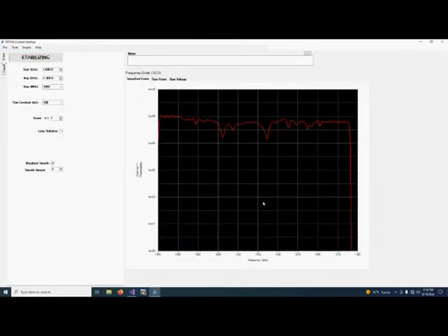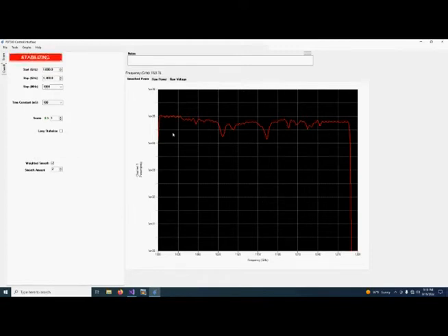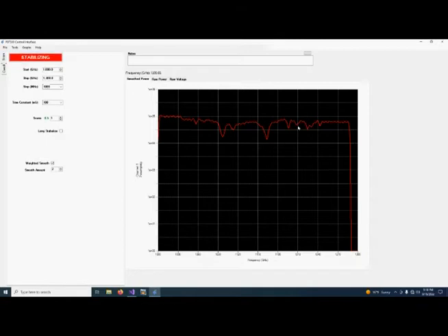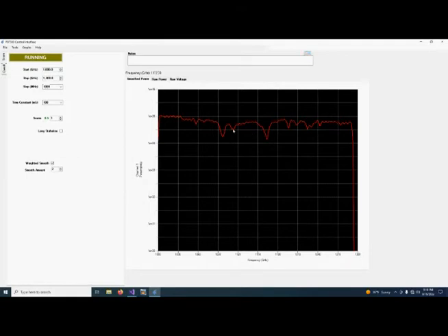And as you take more and more data so that these systems can do averaging where they scan up in frequency and then back down, the noise on the signal will decrease and you'll be left with just your water lines which you can see here, here and here.